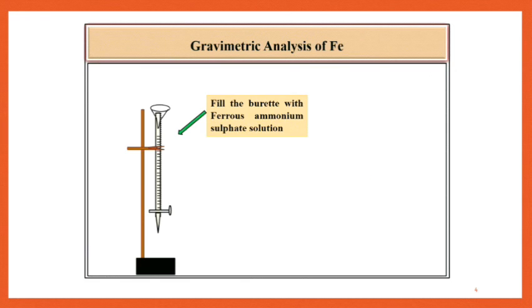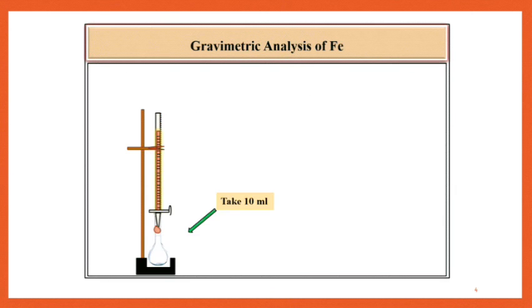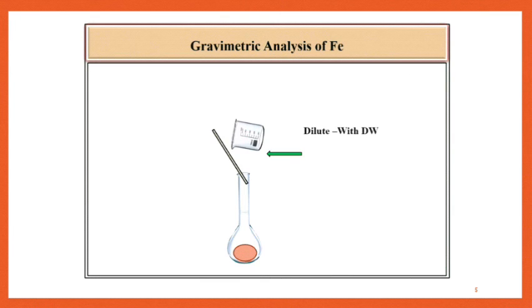Procedure: Fill the common burette with the solution of Ferrous ammonium sulphate. Then take 10 ml Ferrous ammonium sulphate solution directly in the 100 ml volumetric flask.